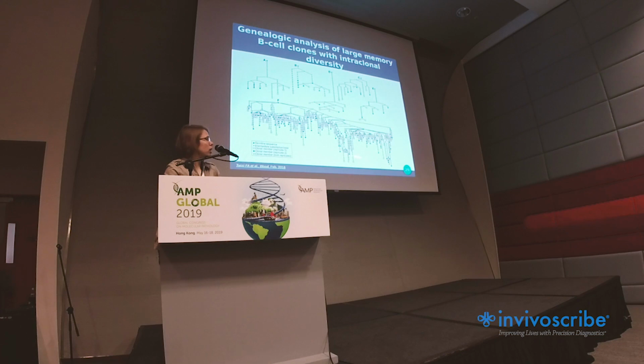This one, this really large one, it's above 50 sequences, was the second largest clone we had in the HCV patient, and it's from non-class switch memory B cells.